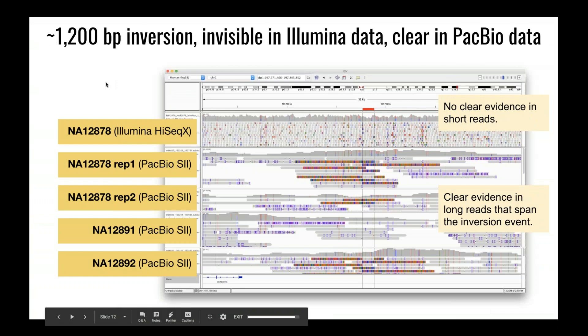Here's another example: a 32-kilobase locus where the region highlighted in red harbors a fairly large inversion, almost 1,200 bases long. Because that event is so large, the signal in the Illumina data is not clear. In the PacBio data, however, we have a clear signal with reads that map correctly right up until they hit the breakpoints of the inversion event, at which point all the bases suddenly appear mismatched to the reference. By looking down the column you can identify the inversion sequence. This is an event it's not clear how you would call with Illumina data, but the PacBio data makes the nature of this event very clear.